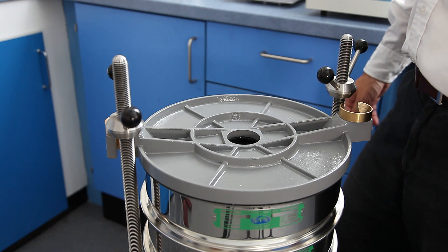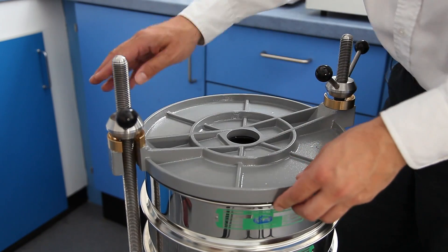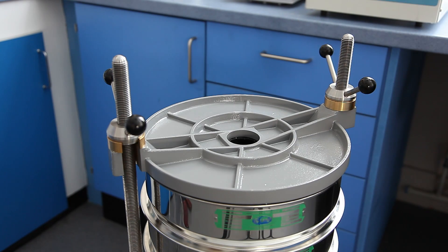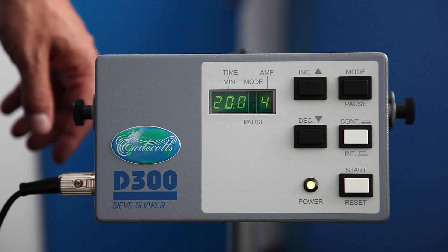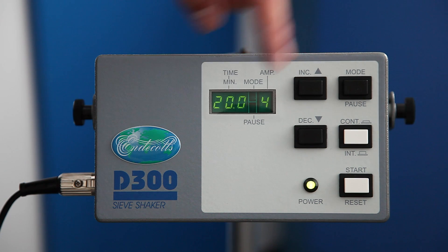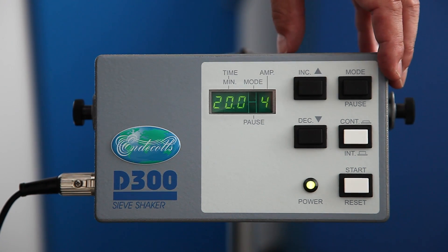As with all our shakers, the D300 has an easy to use clamping system. The D300 has the same control box as the D450, giving it different parameters for your different sieving settings.